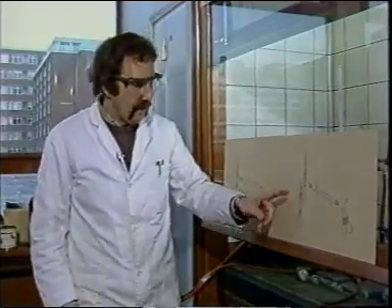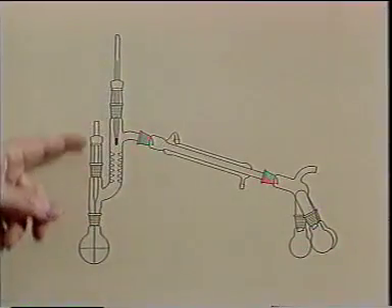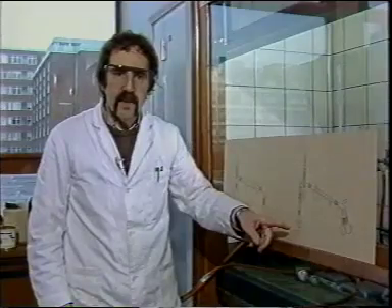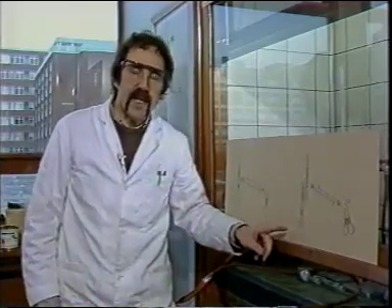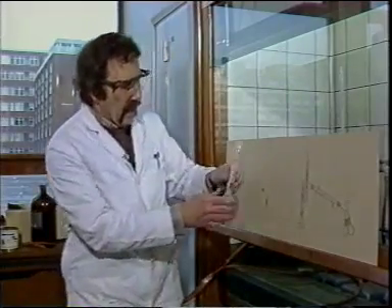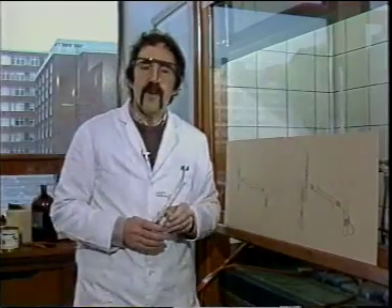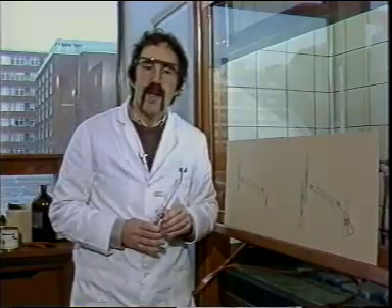We also solve the bumping problem by using an air bleed. A fine stream of bubbles is drawn constantly through the bleed and agitates the surface of the liquid, giving us even boiling. If we have only a small volume of liquid, we don't need to use an air bleed — we can use a flask filled with glass wool instead, which also ensures even distillation. But as most of you who will be doing this experiment at summer school will use an air bleed, I'll show you how to make one now.